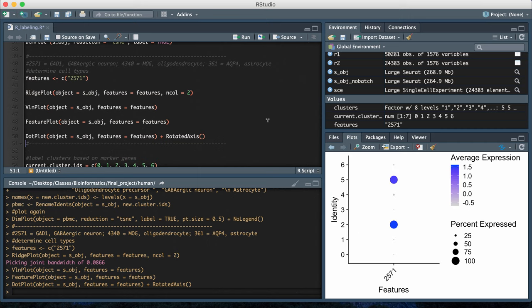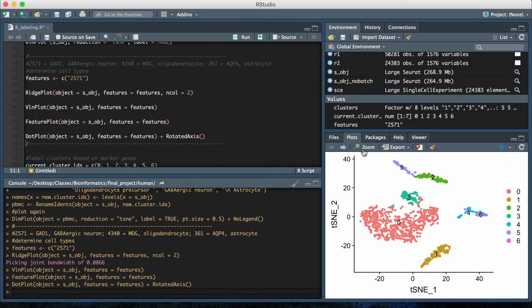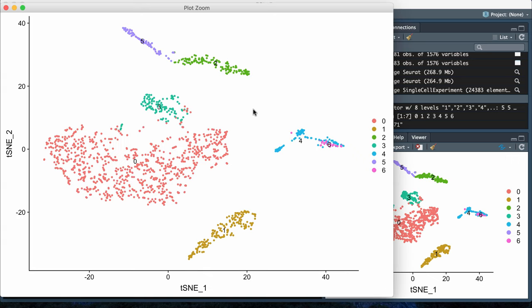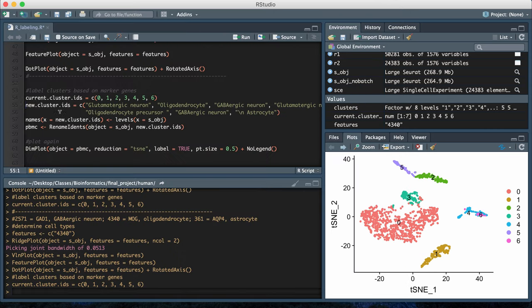Finally, the dot plot again shows a similar idea. You see high expression and a high percent expressed in cluster two and cluster five. In the original t-SNE plot, the algorithm was separating cluster two and cluster five as different clusters, but this analysis is showing that you might have a reason to merge these two cluster labels together into one cluster.